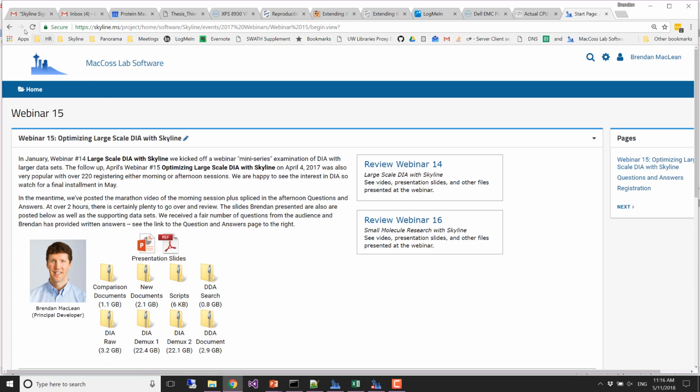You're almost better going back and watching the recordings of this course. But if you can download these data files, then you can do other tutorials and deal with other scripts. Unfortunately, there's not a written tutorial on setting up the scripts and doing Skyline command line. So that's that.